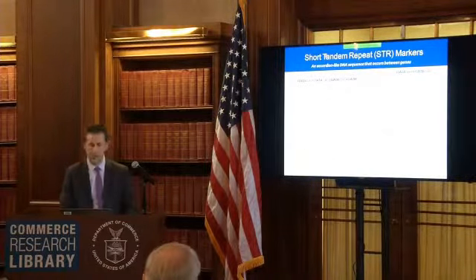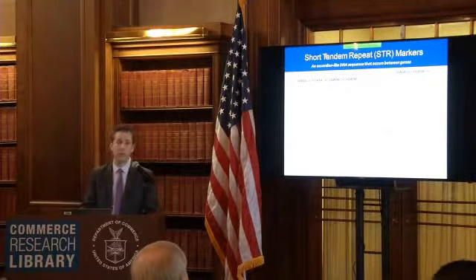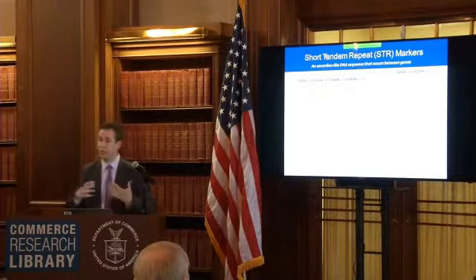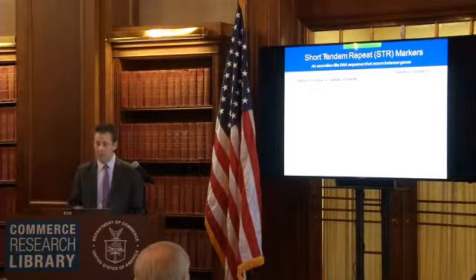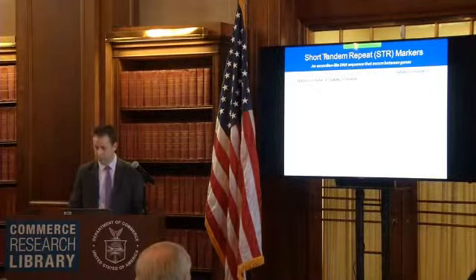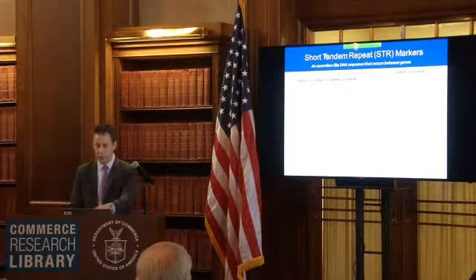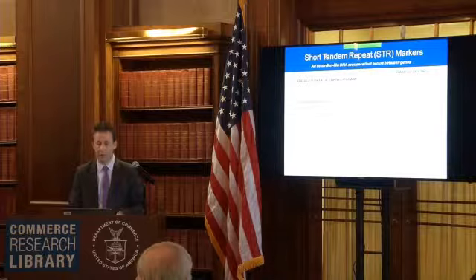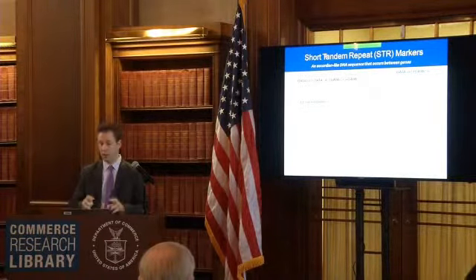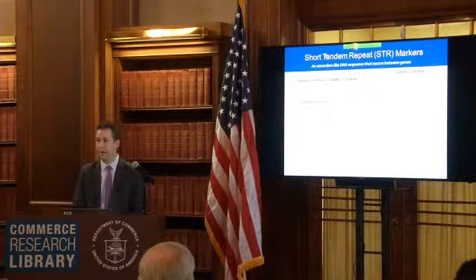One way to think about it is a kind of accordion-like sequence that occurs between genes. And again, I have it here where the sequence in black would be conserved between 2 individuals, and then this repeat motif is what's going to be variable. The number of repeats there is going to be variable. So in this case, you can count these off, and there's 12 GATA repeats. So in a test, the number 12 is what's reported, and it's called an allele. That's just the state of that marker.